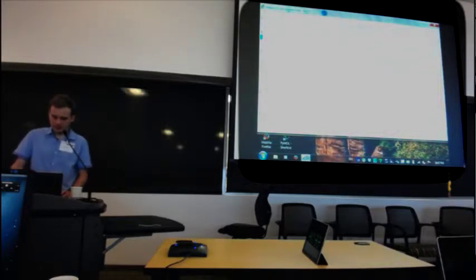Which file is this? This is the convert.cscfg file. And the line is almost at the bottom, and it's called ini run template. Where is the lines of queue?